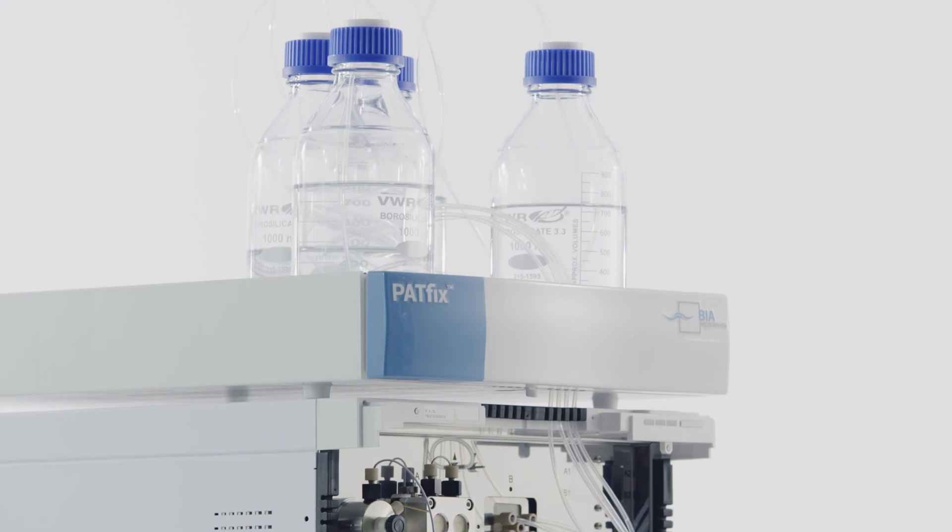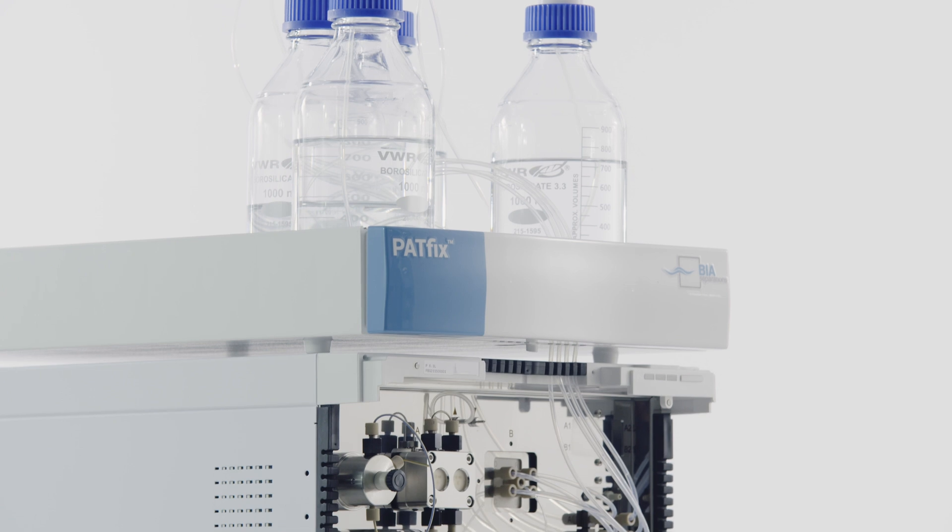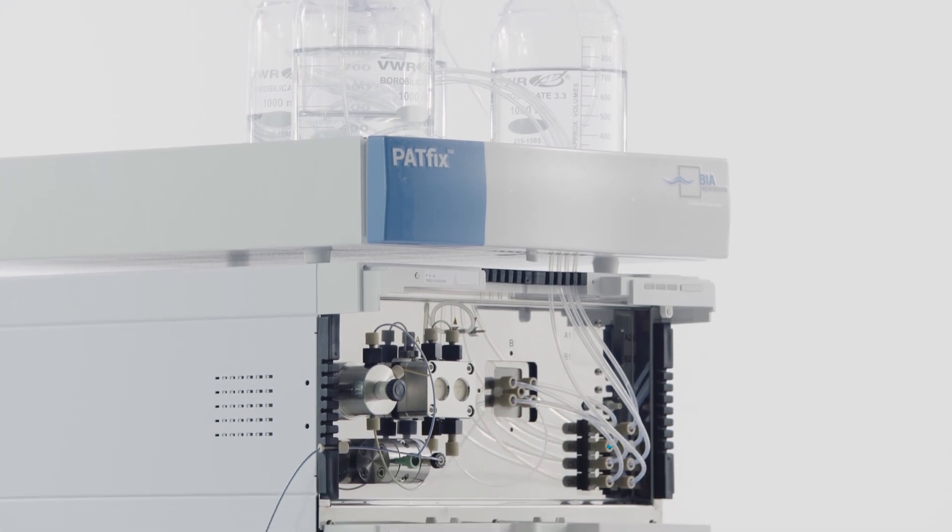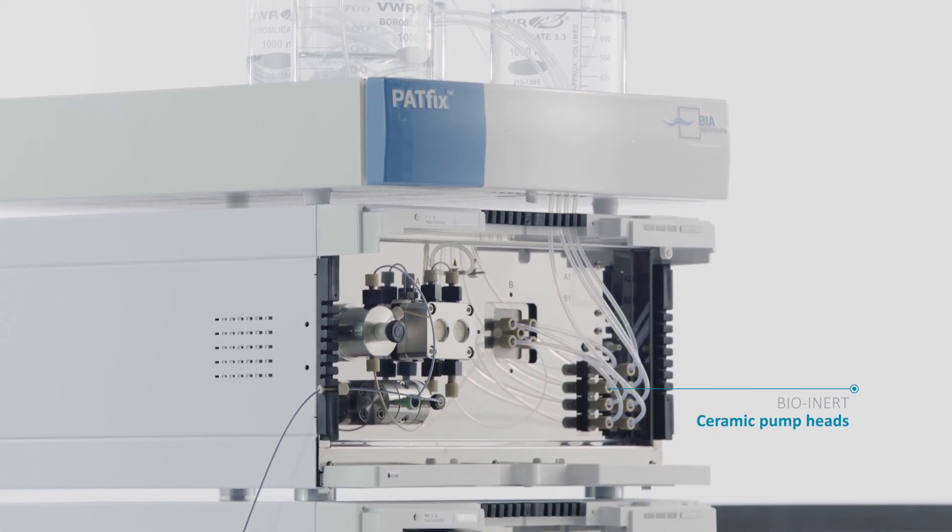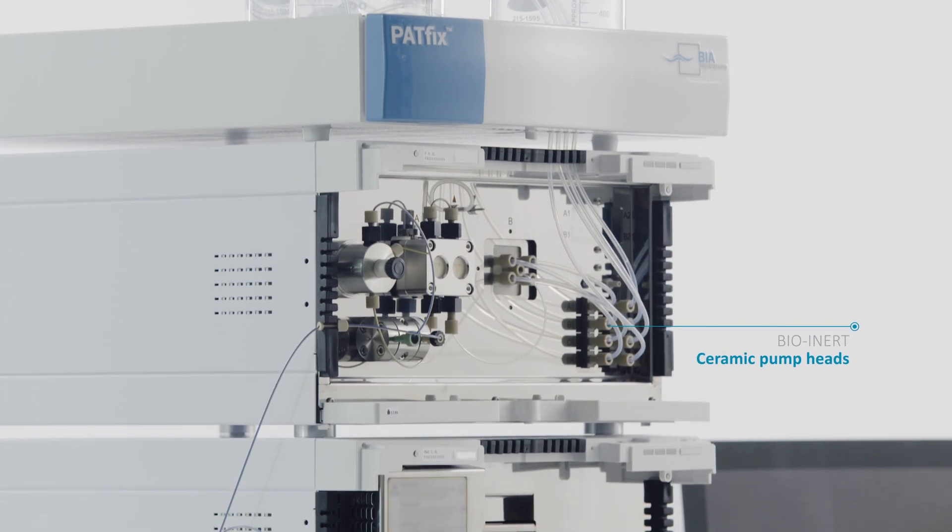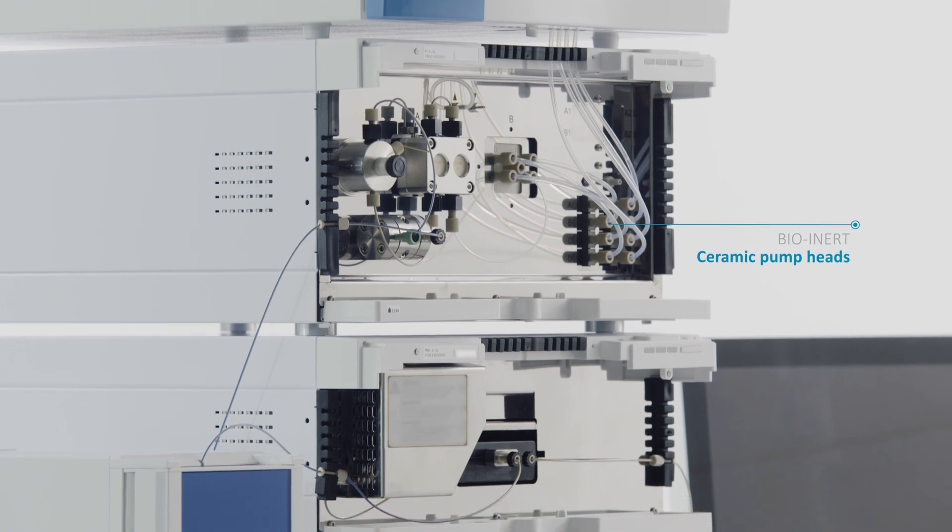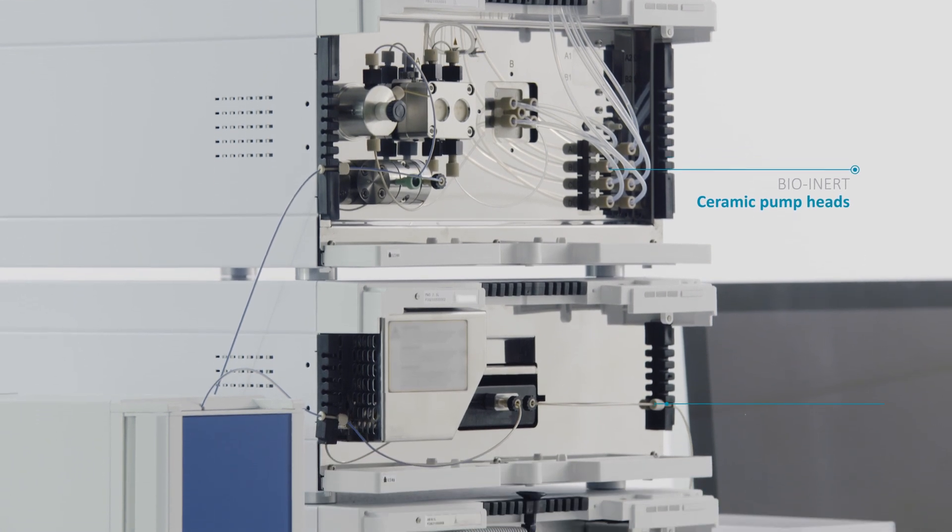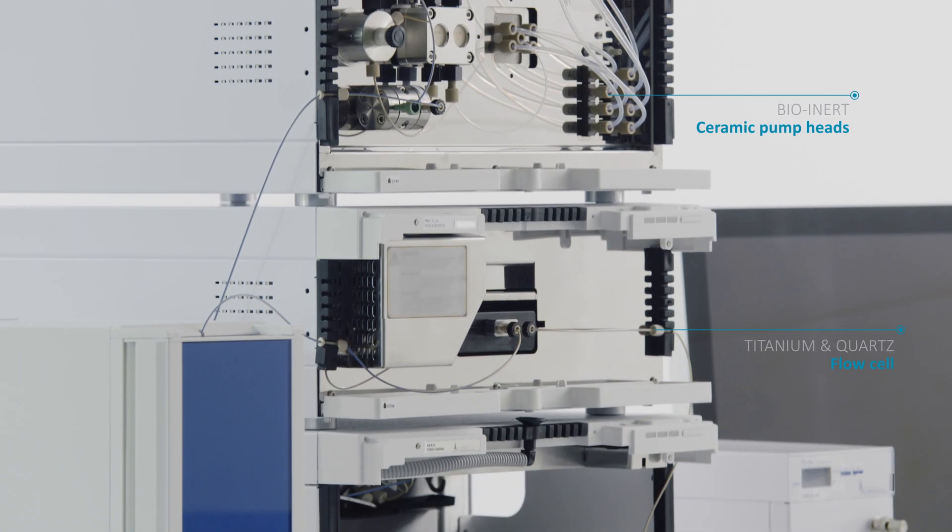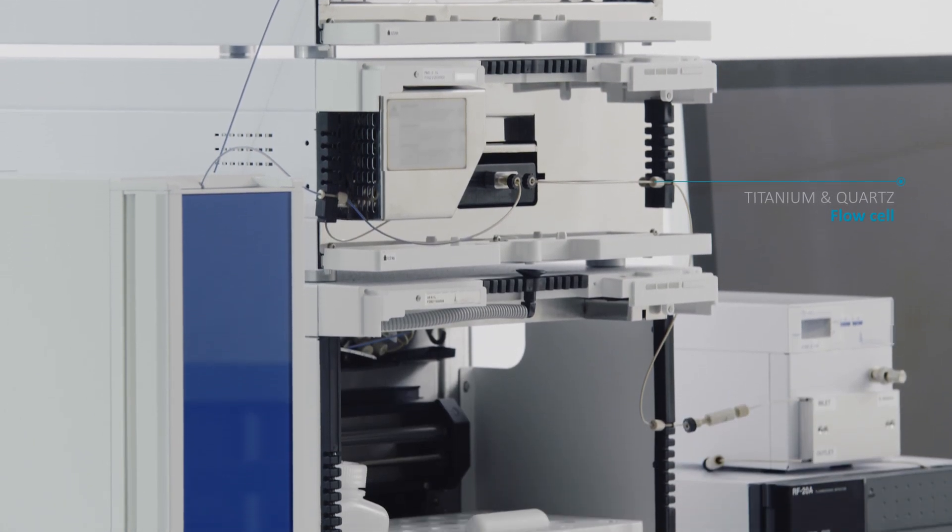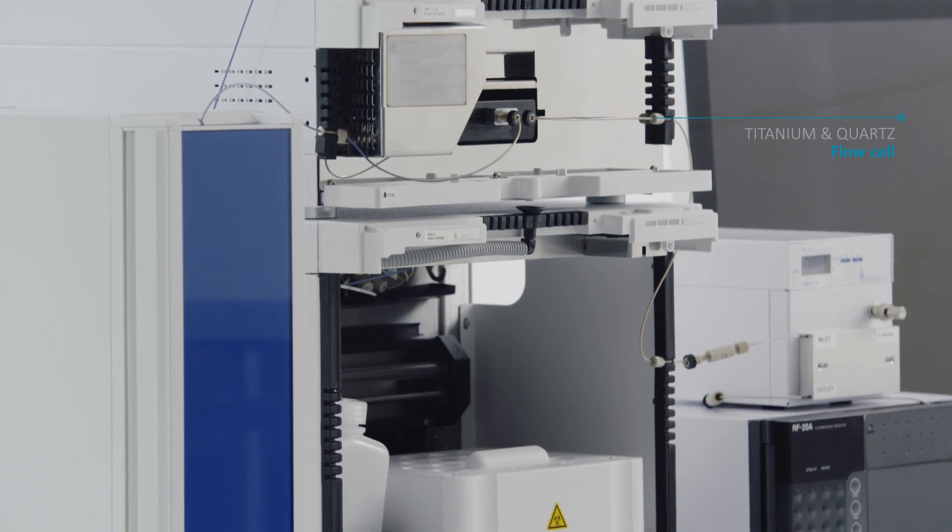You've probably heard about the PatFix platform but aren't sure what it can bring to your benchtop. Achieving the correct hardware setup for reliable and reproducible analytical separation of large biomolecules is not trivial.